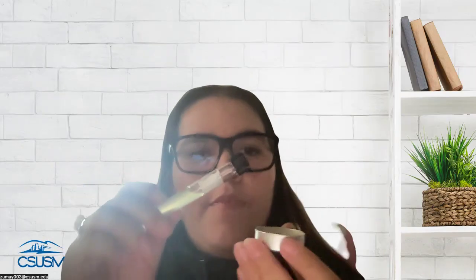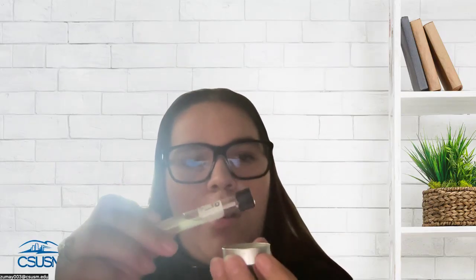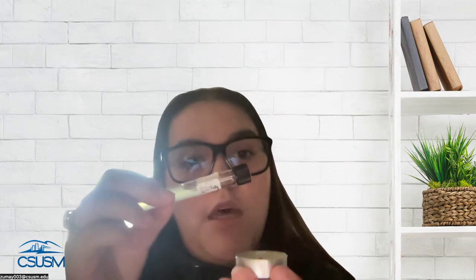So first you're going to take your bacteria tube, such as this one, and you're going to take a tea light, such as this, and you're going to take off the cap and turn it over the tea light. This is to make sure that you are not contaminating or getting rid of any microbes that are on the surface of the tube that you are testing.